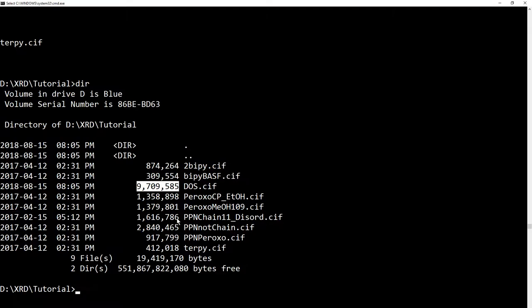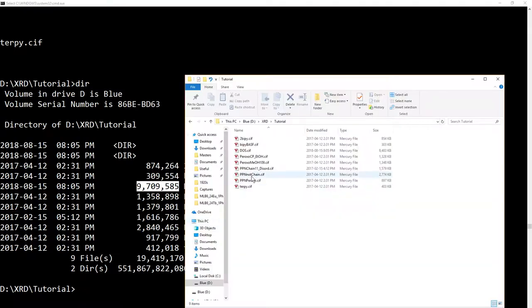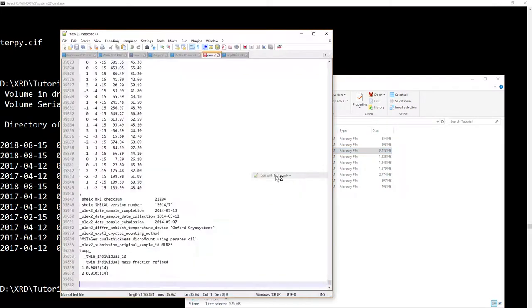you can see dos.cif is now the same file size as all those other files combined. We've just merged them exactly as they are. And that's it. You've now combined those into one file. And you can see it's very long.